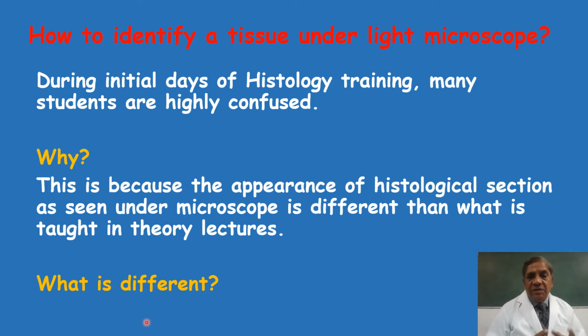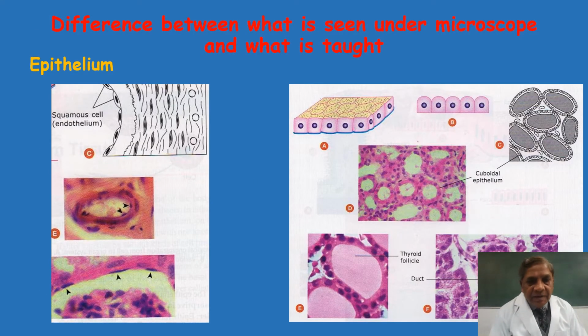Now, what is the difference which you will be seeing? What your teacher has taught on the blackboard and what you are seeing under the microscope, what is the difference? What difference will you see from what your teacher taught you?